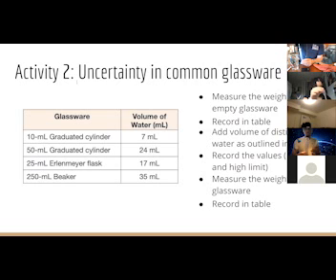Because if I get water on the side, well, obviously that's going to add to the mass, but it doesn't really add to the volume. So if I have bubbles or if I have water on the side, I want to tap those down. Then when I get close to 7, I really want to stick my head in there.